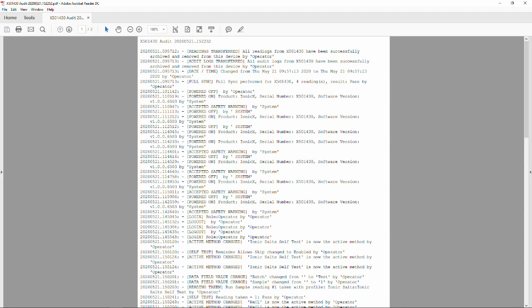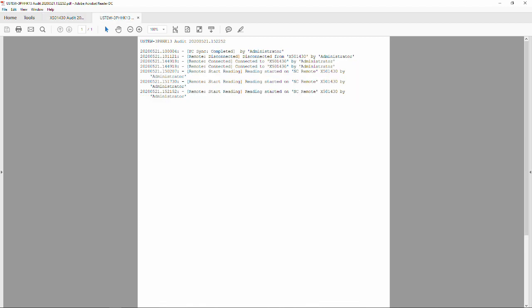Finally, the audit log captures the series of events that have occurred on the instrument. User actions are recorded between sync events in the order they occur to maintain data compliance. Audit logs that capture work performed using the Ionic X suite of software applications is also generated.